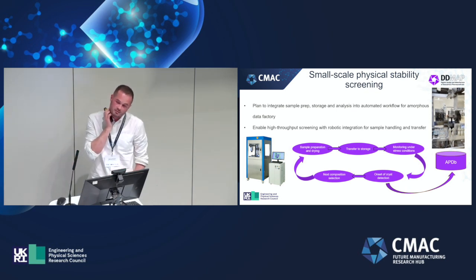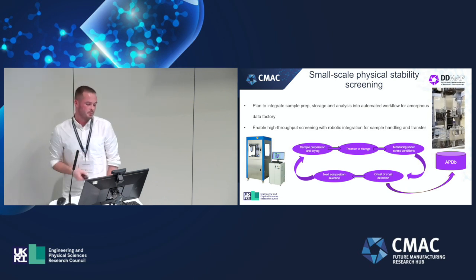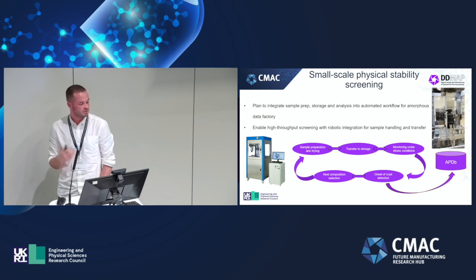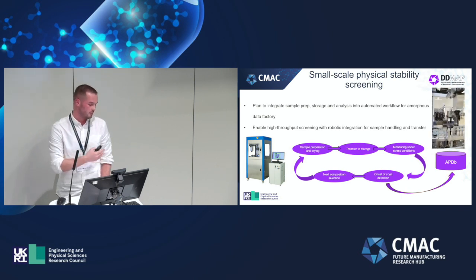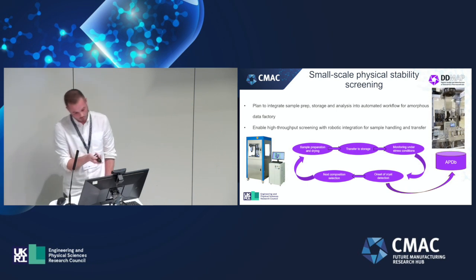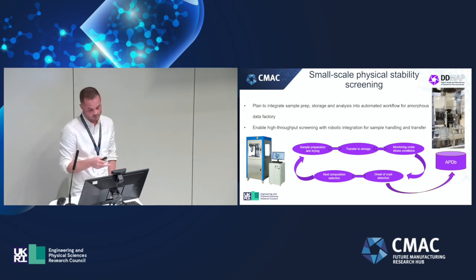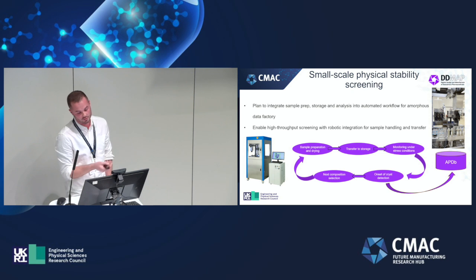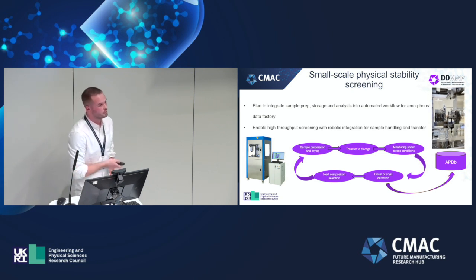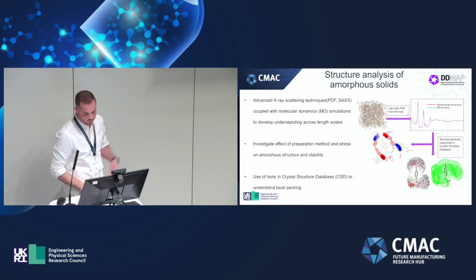So we've got a ChemSpeed sample prep robot being delivered next week now. And that will be churning through a lot of samples, automating the full sample prep and drying, and we'll get some robotic integration for transfer to sample storage. And what we'll talk about in more detail is the monitoring and automated image analysis to detect onset of crystallization and related information. All that data going to the database and using multi-objective optimization for next sample selection, and just run that in an automated loop.